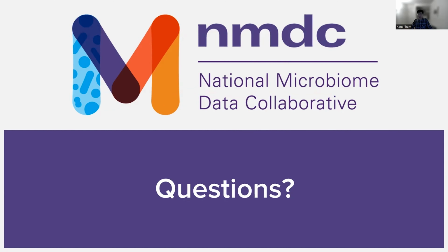So that is quite a bit about metadata in just a little bit of time. And I hope that you now have a better understanding of metadata and why it's so important for not only your science, but also for other scientists in the field. The main lesson that I hope you come away with is that metadata is just as important as your main sample data, and that without either one, you really can't make a good conclusion.